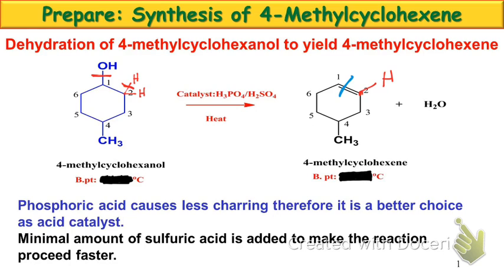So now that we've got a general idea of what's happened, we're also going to want to evaluate how we can isolate our product. The goal is to make it and isolate it. So we can go through and start to apply the knowledge that we've gained from the previous experiments on how we would isolate things. So what's a possible isolation technique?